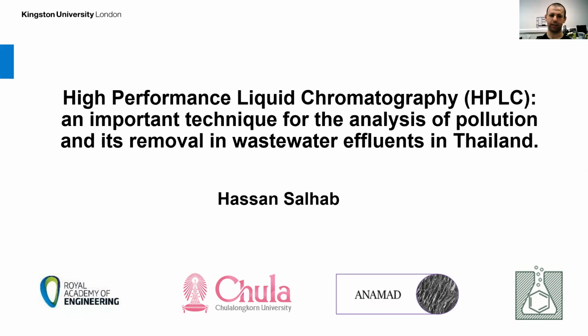Today I will be delivering a presentation about high-performance liquid chromatography, an important technique for the analysis of pollution and its removal in wastewater effluent in Thailand.